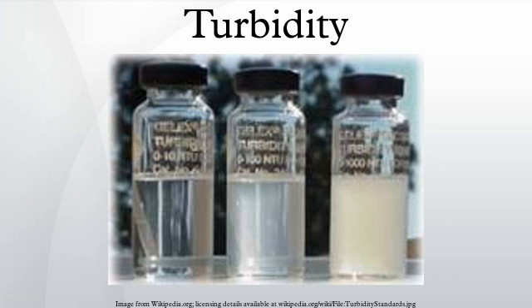To some extent, how much light reflects for a given amount of particulates is dependent upon properties of the particles like their shape, color, and reflectivity. For this reason, a correlation between turbidity and total suspended solids is somewhat unique for each location or situation.